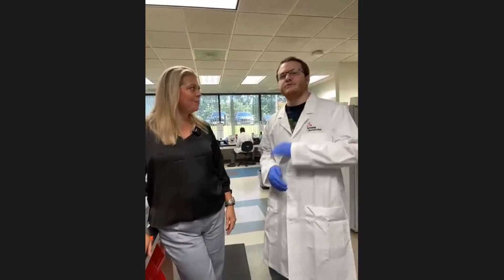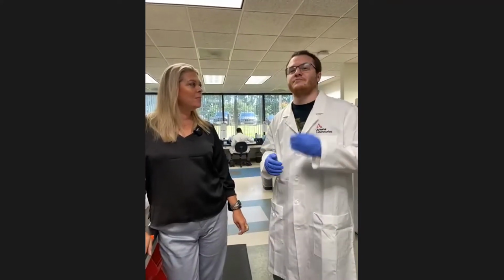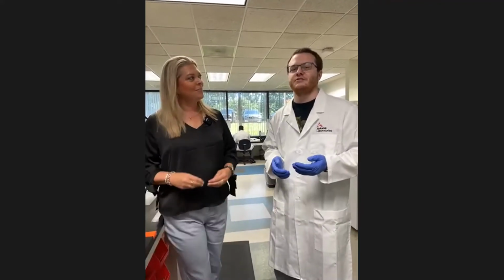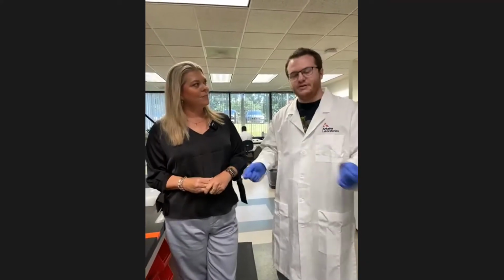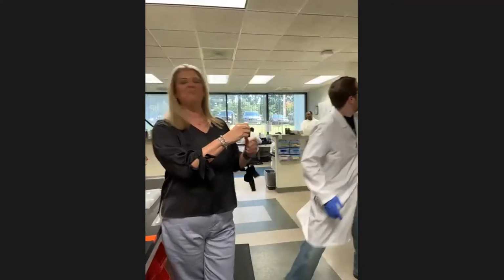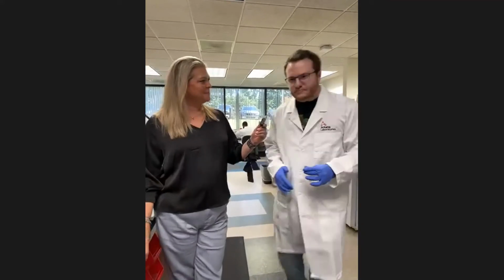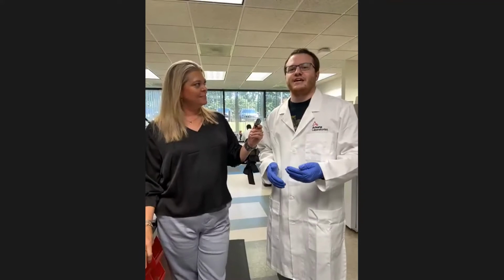All right, so firstly, we receive the packages and we lay them all out on the counter. We organize them by East Coast versus everything else. We defer to the East Coast because they're a few hours ahead of us here in Arkansas, so they need to be called a little bit earlier. We open up each of the packages. We verify the patient information is consistent and correct with the bottles. We separate each of them from each other using these little bins here, just something simple. And then we also put the transplants to the front because they require an extra set of stains that take a little bit longer.